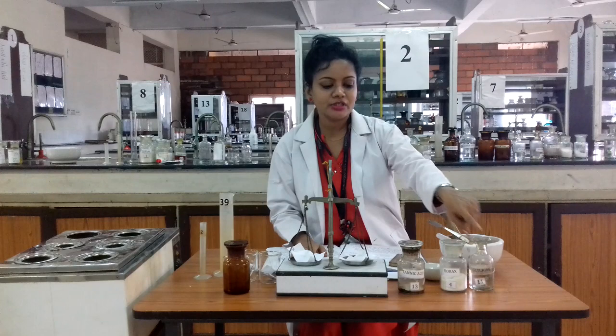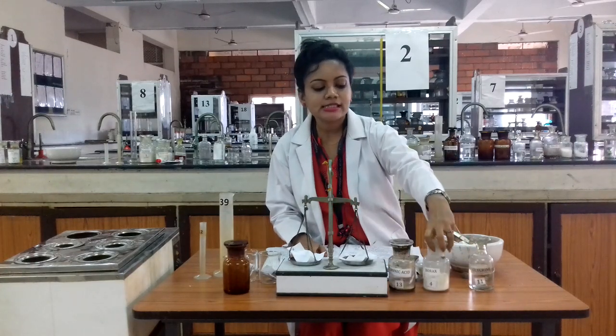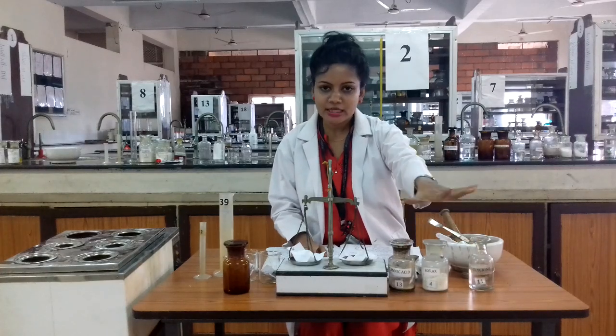These are the main ingredients for this gum pain preparation: tannic acid, borax, and glycerin. These are the three ingredients for this gum pain preparation.